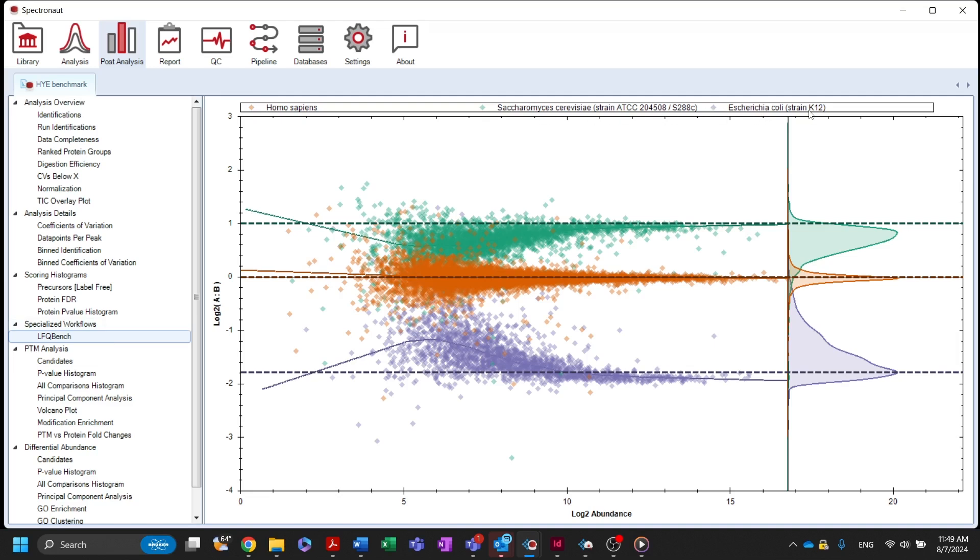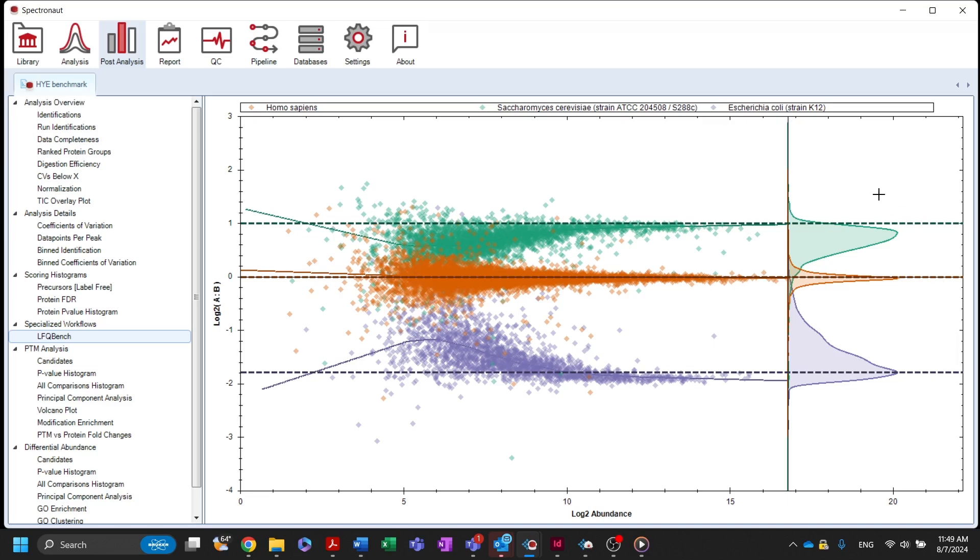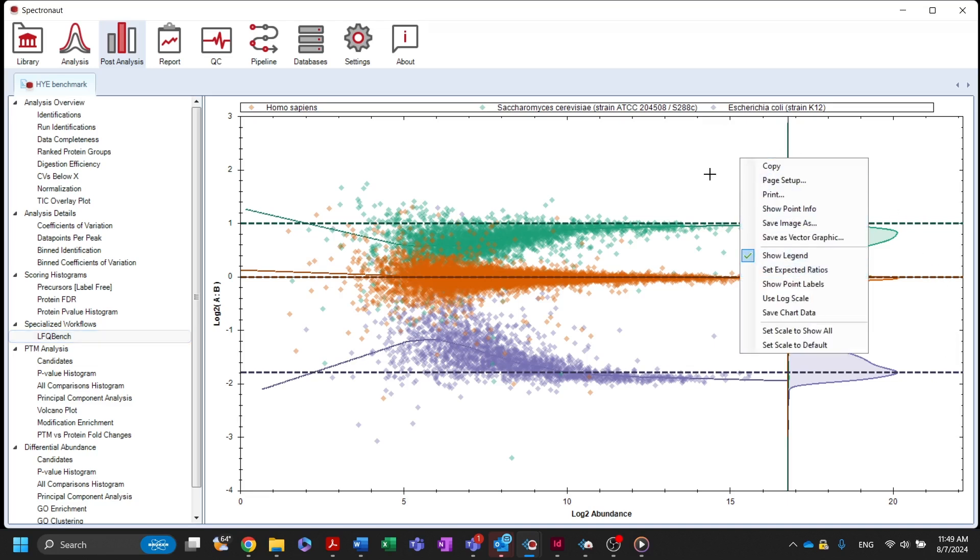Expected ratios are represented by dashed lines and can be set by right-clicking on the plot. The distributions on the right side of the plot show how the experimental values deviate from expected ratios.